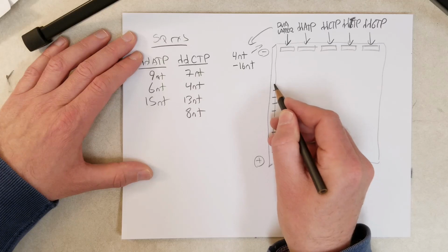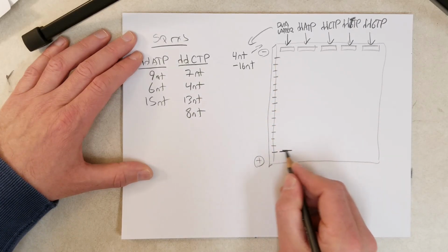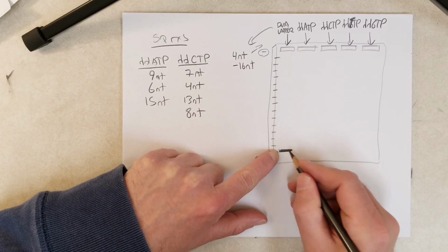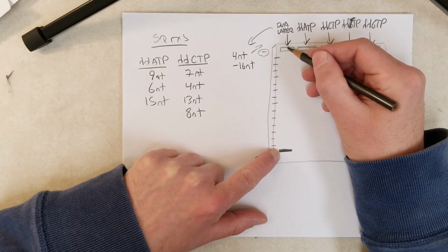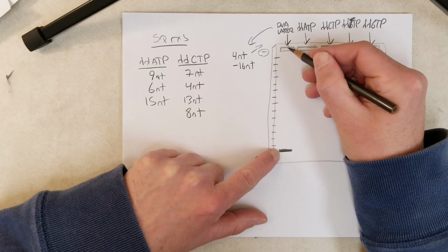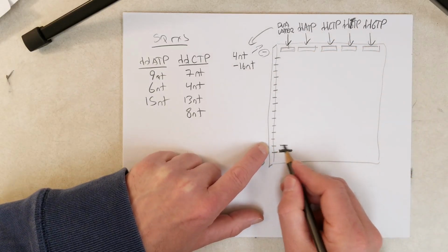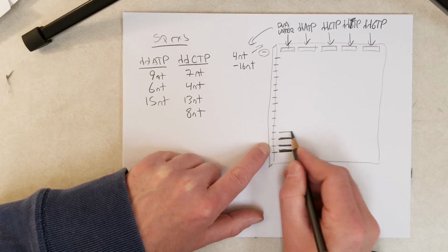I'm just going to put these little markers here to help me diagram somewhat neatly. This little band right here is DNA. Why is it shaped like a rectangle? Because when we added the DNA, the DNA molecules filled this whole well. So when they migrated through, they maintained the shape of the well up here, forming these rectangular bands.